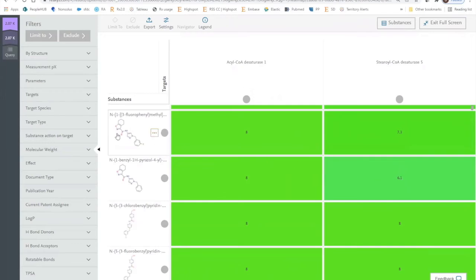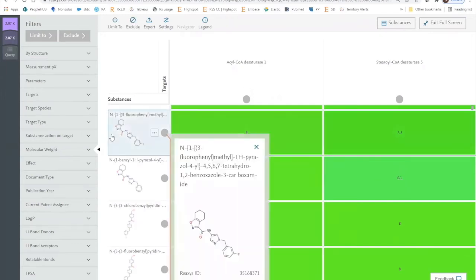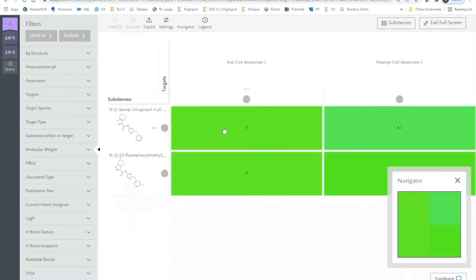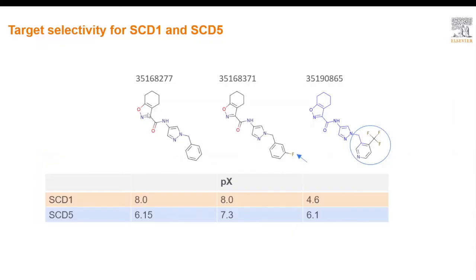Now we can scroll down to look for substances that act on SCD1 that minimally act on SCD5. We can cherry pick a few of these rows and limit the search to just those rows. These analyses can be exported for further SAR analysis. Here are a few compounds that we cherry picked from the heat map. The first compound exhibits two orders of magnitude difference in potency between SCD1 and SCD5.